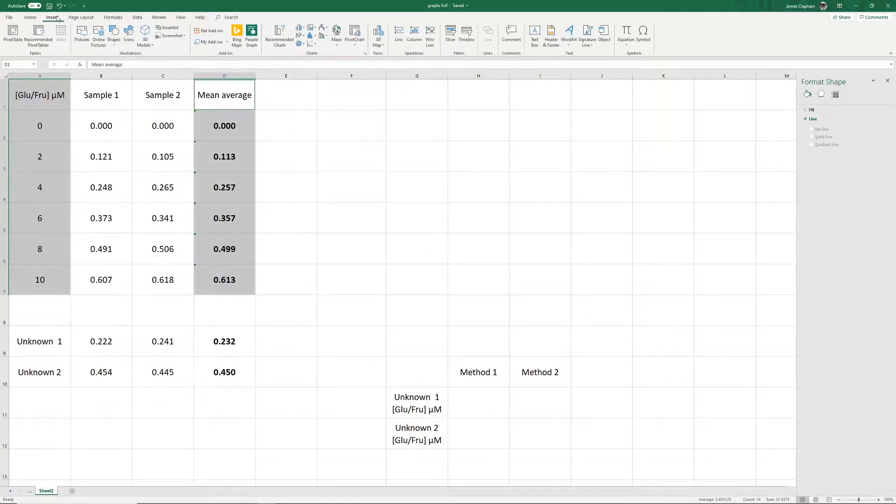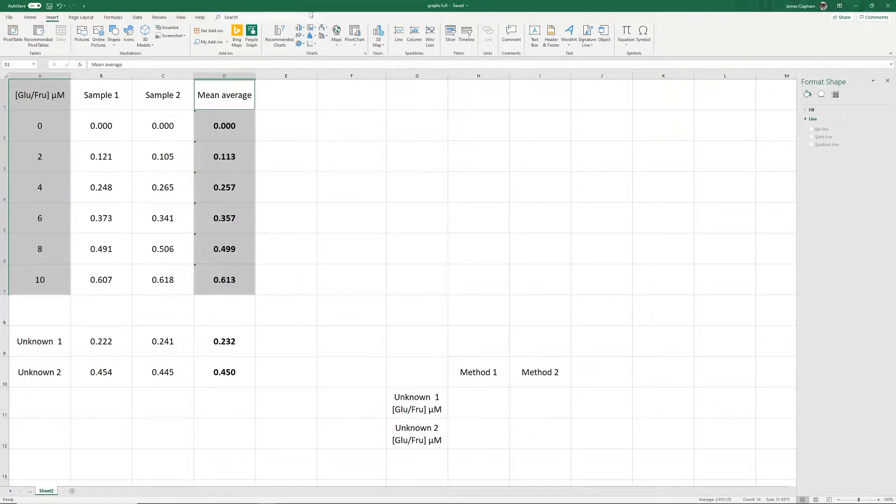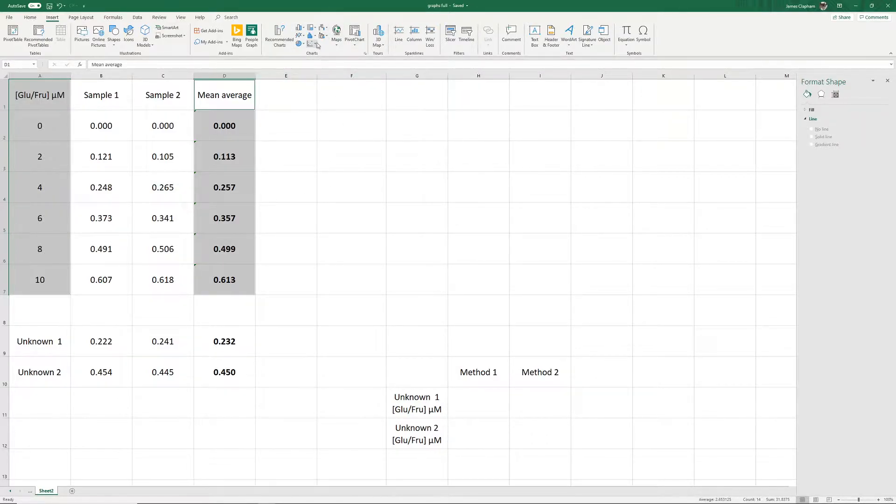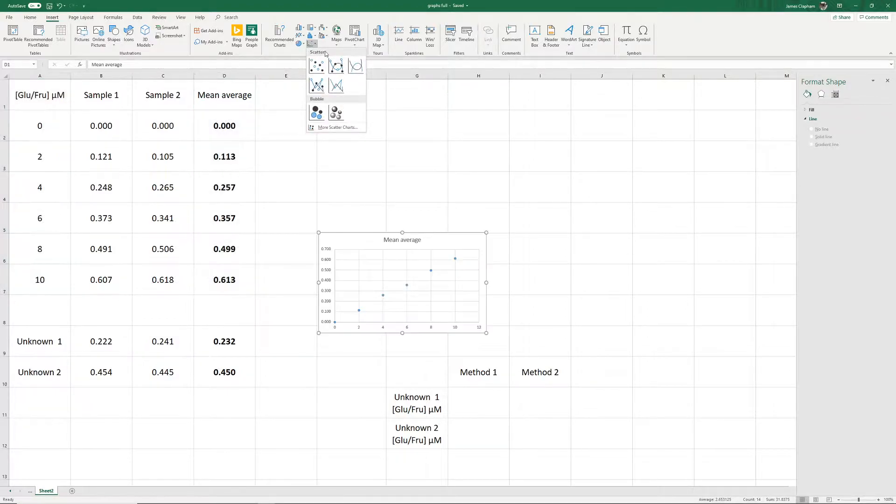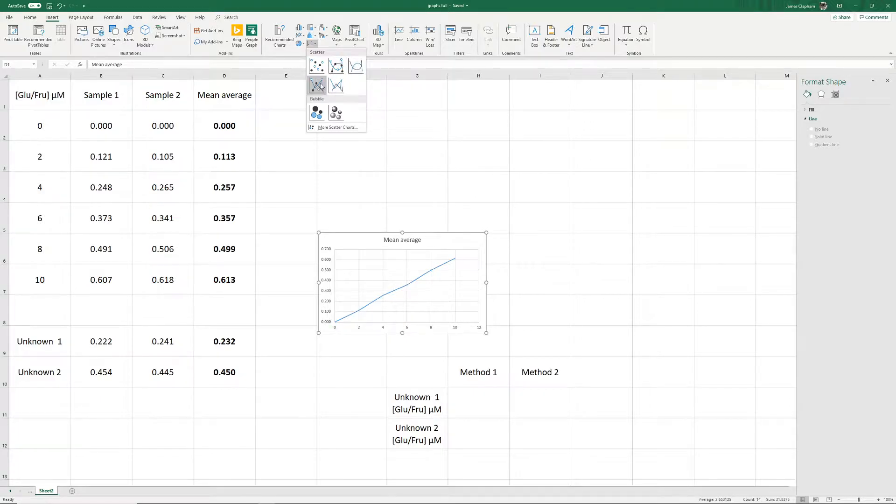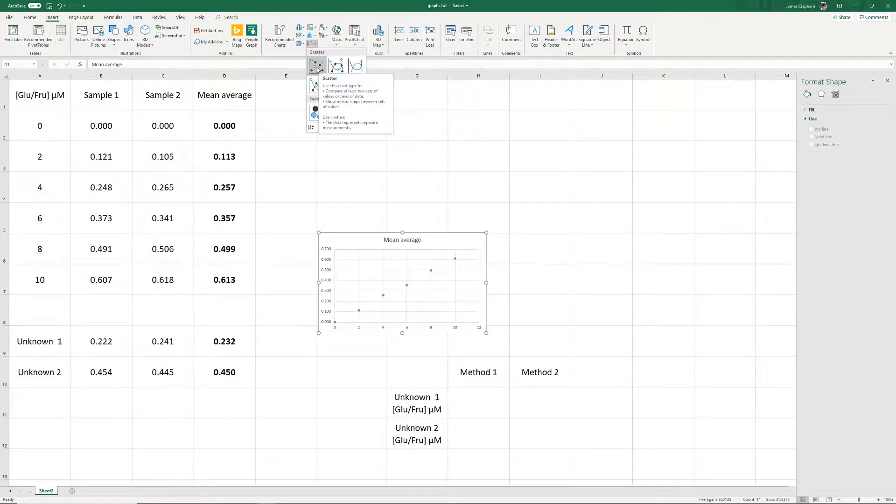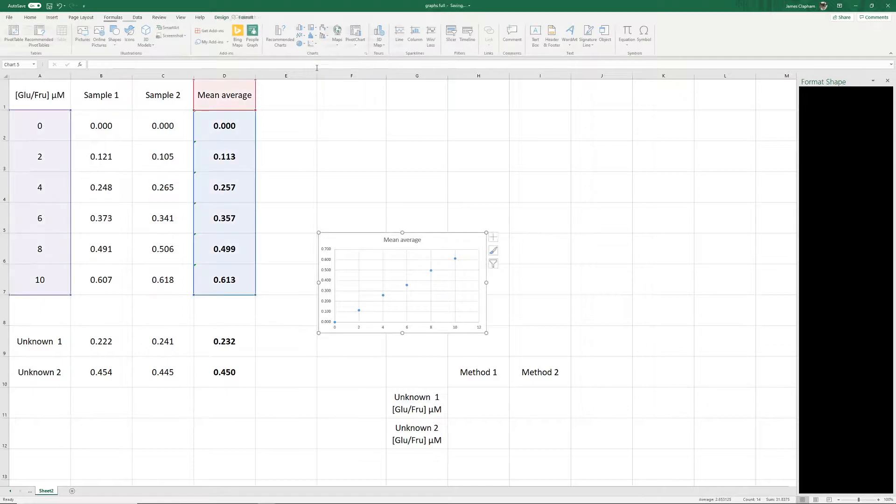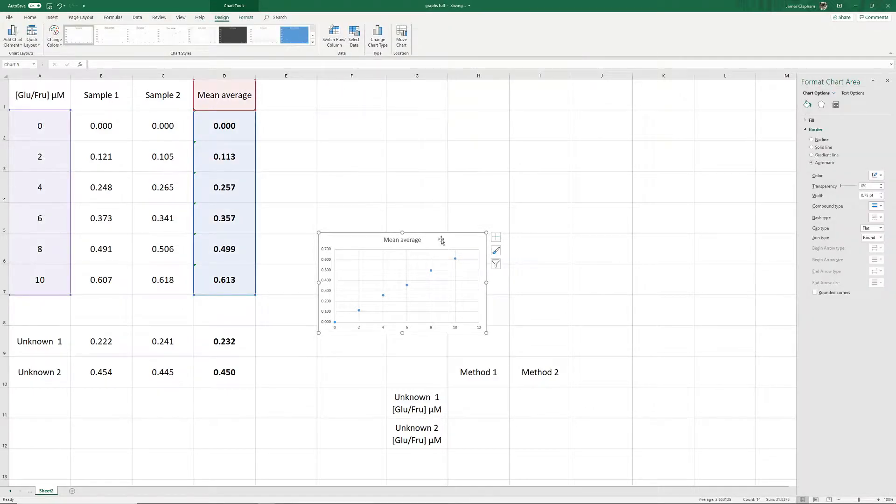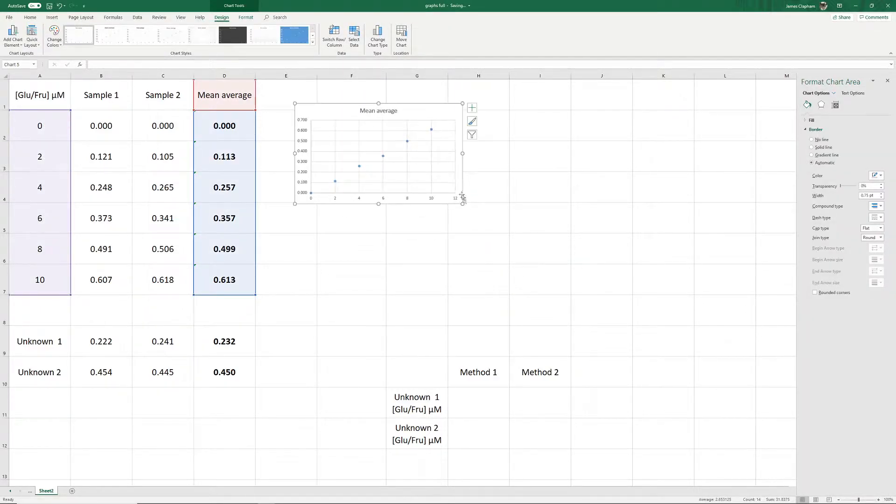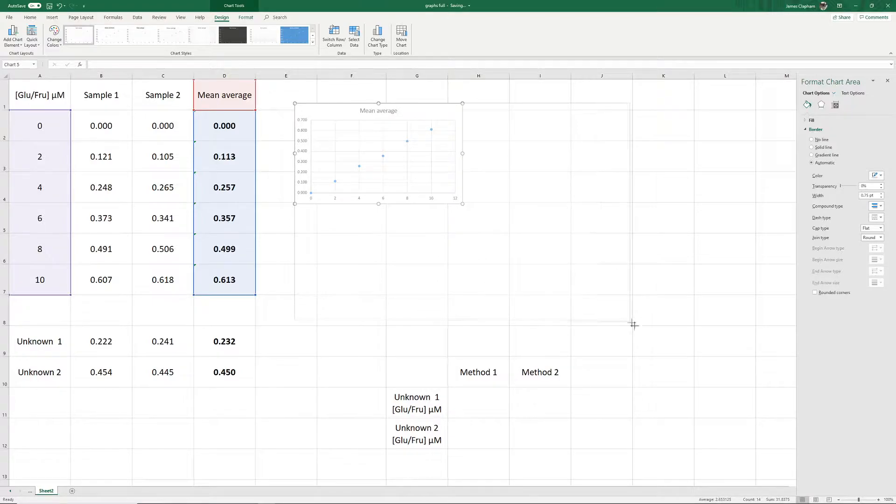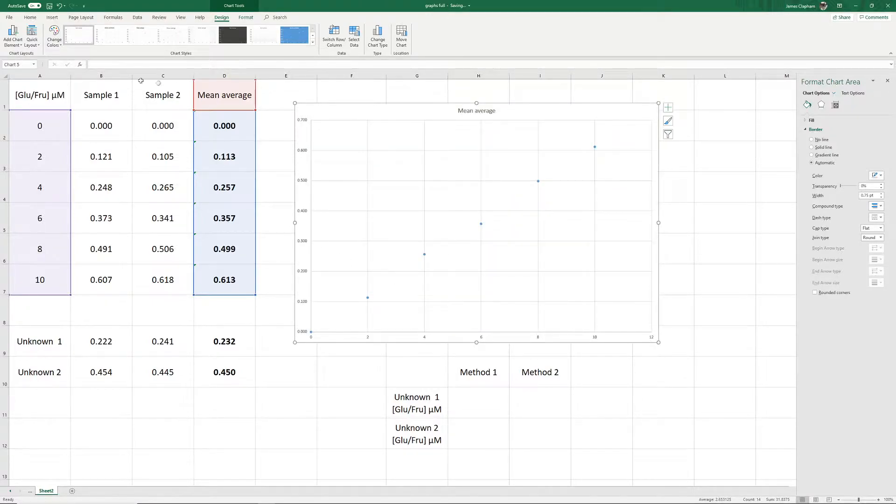We're then going to insert. Over here we have all the different kinds of graph we can insert. We want this bottom one, which is a scatter graph, and we want the first one. We do not want the ones that connect the data points, just the data points on their own. Here we have our graph constructed from our values.